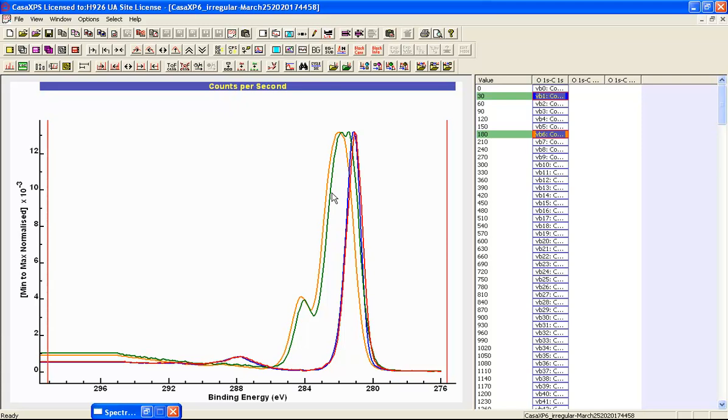The obvious thing here is that there's a shift. The PVP that is calculated from the end of the profile compared to the beginning, there's certainly a shift there, and there's also some kind of shift associated with the polystyrene. So these represent an expansion of the dimension in the vector space that was used in the case of the carbon 1s. There was only a two-dimensional plane that was used to project all the data vectors onto, and now we've got a four-dimensional space onto which these data vectors can be projected.